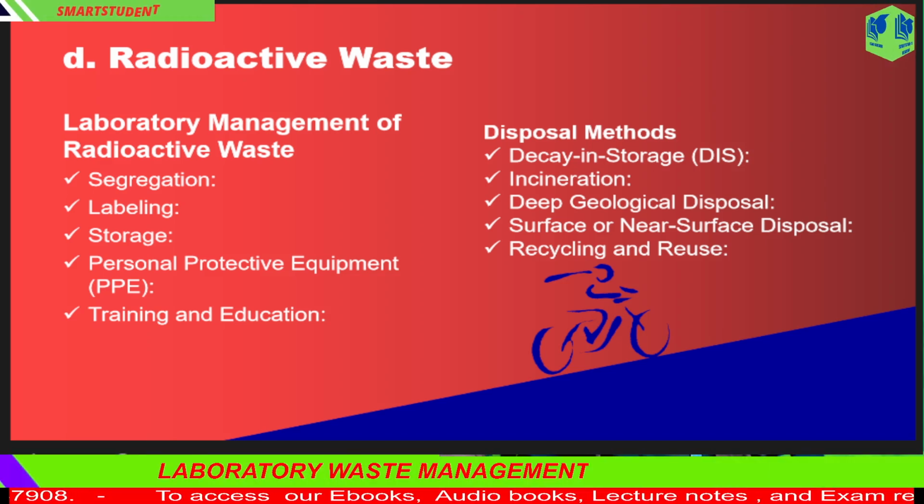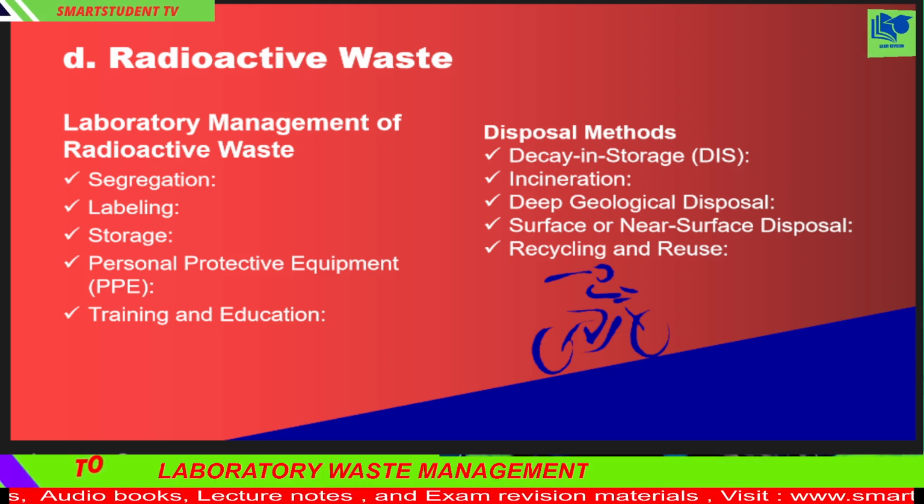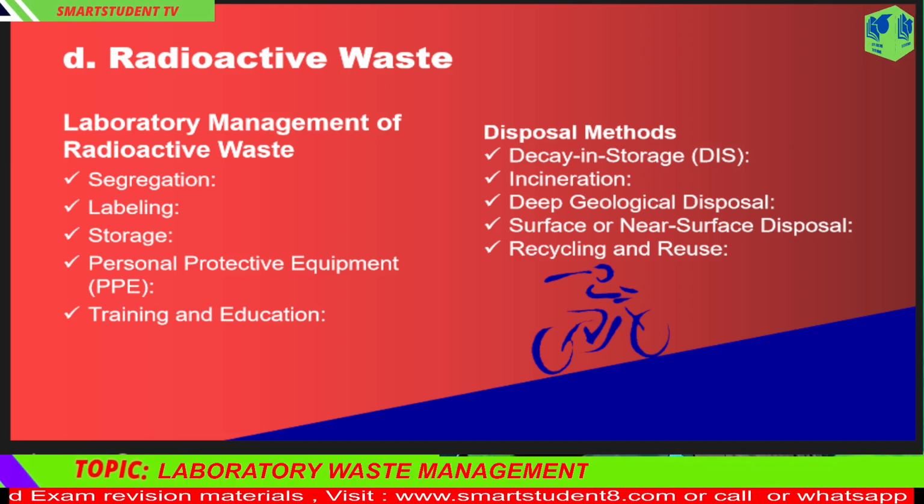7. Conclusion. Effective management of radioactive waste in laboratories is essential to protect human health and the environment. By implementing strict safety protocols, proper waste segregation, and appropriate disposal techniques, laboratories can minimize the risks associated with radioactive waste. Continuous education and adherence to regulatory guidelines are key to ensuring safe and sustainable radioactive waste management practices.